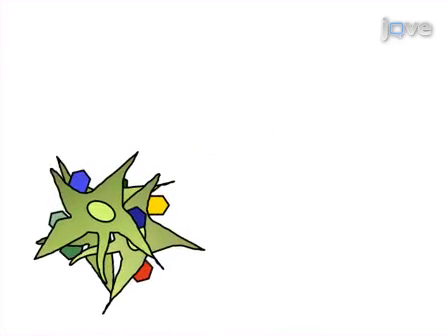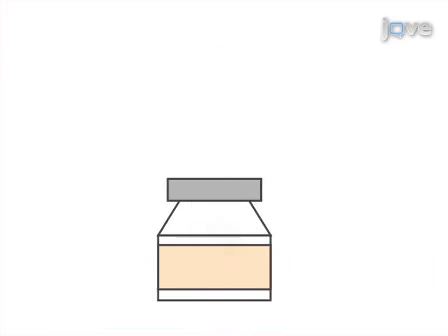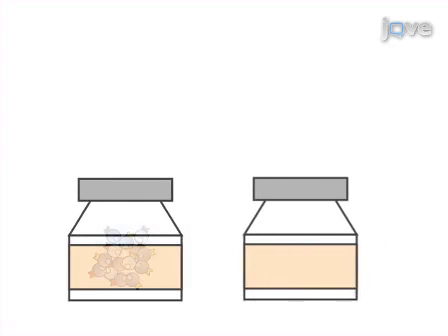antigen presentation. As a second step, the nucleofected DCs are used to stimulate antigen-specific T cells, which are then expanded in the presence of IL-4 and IL-7 in a gas-permeable culture device called a G-Rex. Next, after 7 days of culture, the cells are split and reseeded, and their media is replenished in order to sustain maximal in vitro CTL expansion.